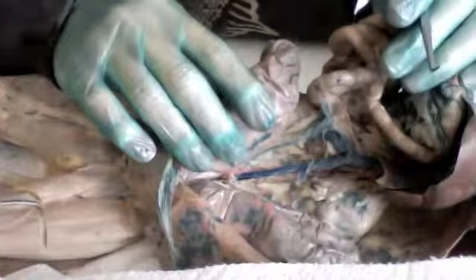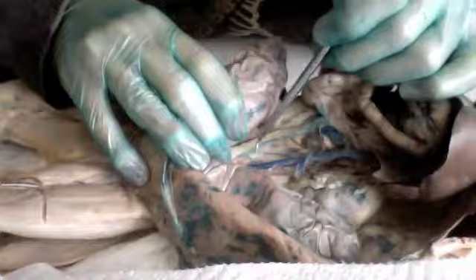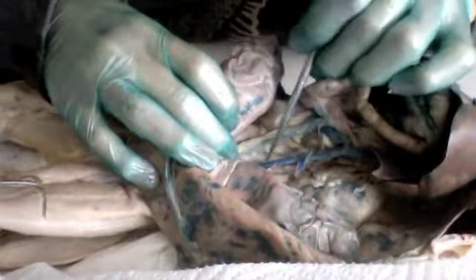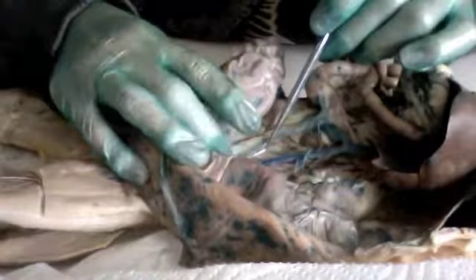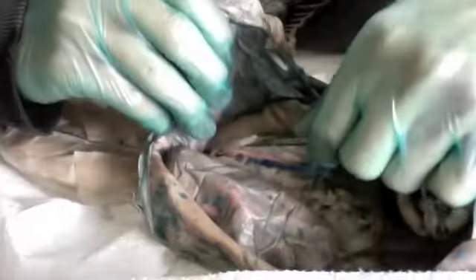And then we have the inferior mesenteric artery. Inferior mesenteric artery is located right here. And then as that moves down, it splits off into the external iliac artery. There's a left and a right side. And that is right here.